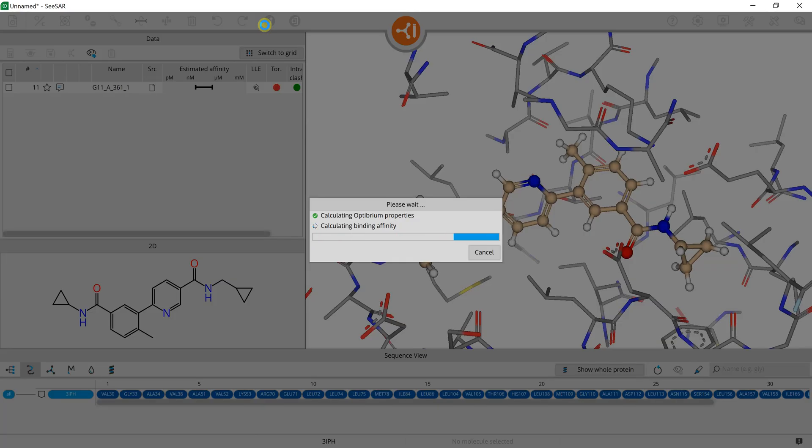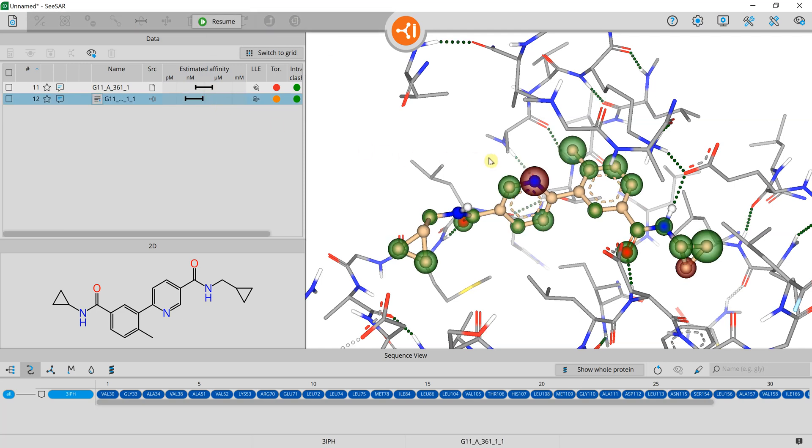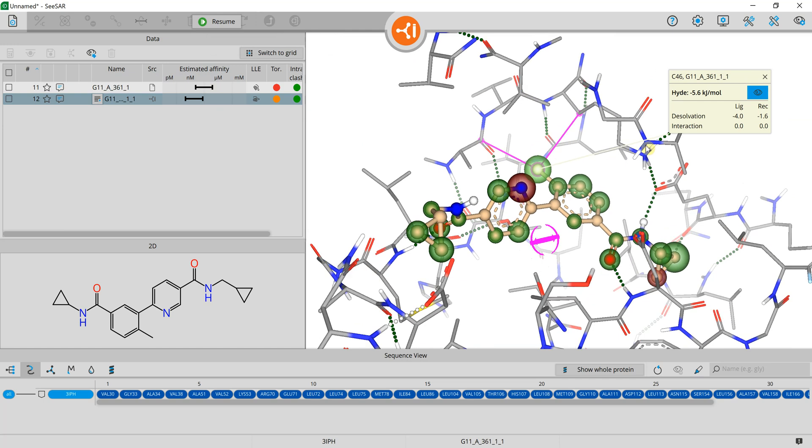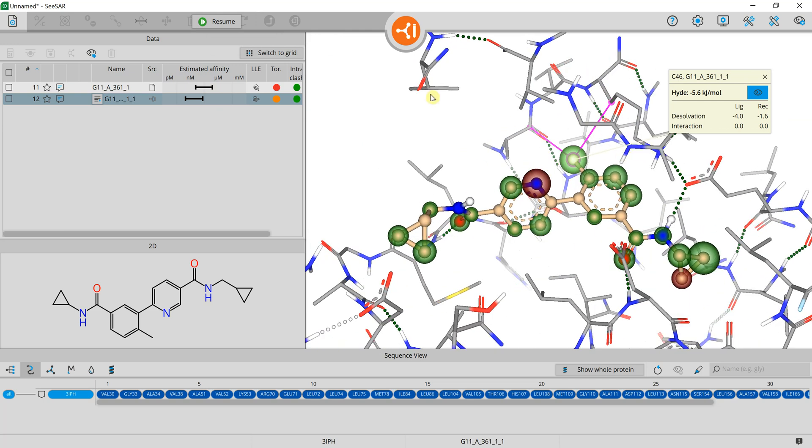We then click on the entry in the table and the green corona on the newly added carbon atom indicates a large contribution and an overall improved binding. We highlight the interacting atoms of the receptor by one click on the eye button and inspect how this methyl group interacts with the amino acid residues.